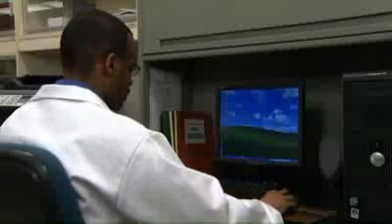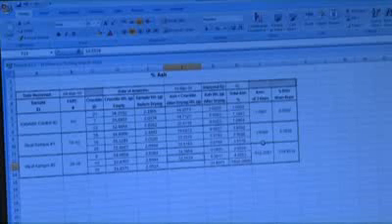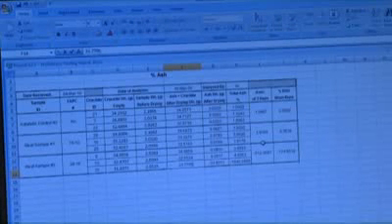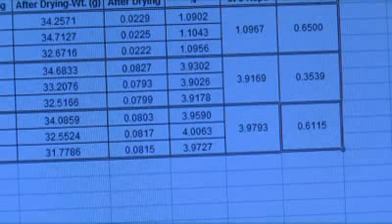As an alternative to manual calculations, an Excel spreadsheet may be used. Here is an example of what a spreadsheet should look like. The sample IDs, container IDs, and weights can be entered as they are observed. With the correct calculation cells set up in advance, the calculation is completely automated and occurs as data is entered.